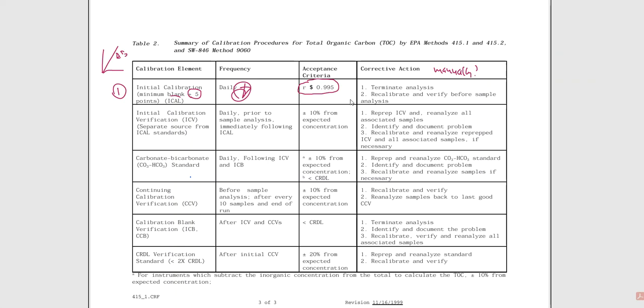And this is why we require every group to produce their own calibration curve, to go through the motions of making a calibration curve. Even if we run your batches on the same day, it does not matter. We're going to make you go through the motions of making a calibration set so that we can run them on the instrument. Every single day, if we did this for a living, it had to be done.